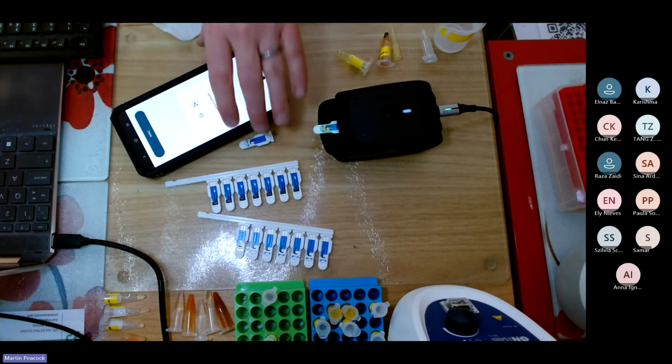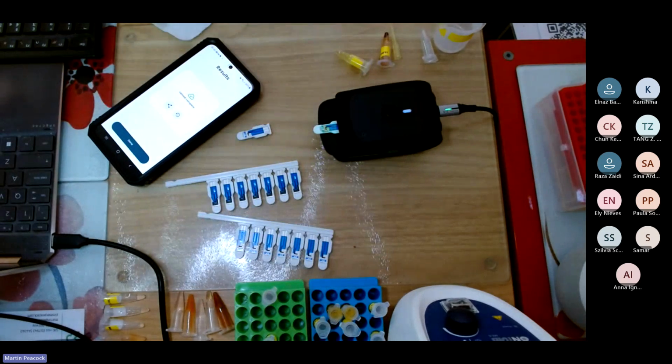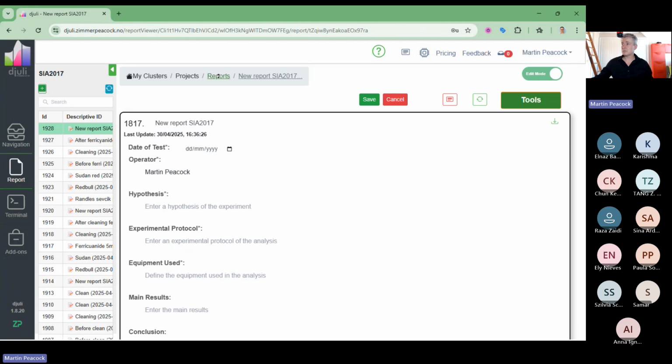Don't forget, now it's gathered 4 bits of data and sent them to the cloud. Can you imagine how much time people tend to take to process this kind of data? I'm just going to share my screen with you again, which I will share here. I will change that here. Right, so let's have a look at this data.